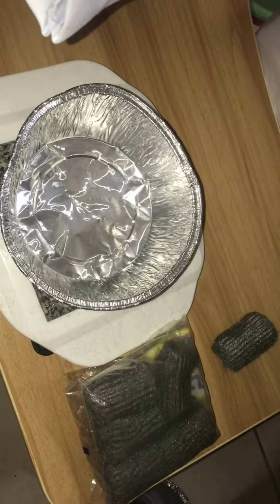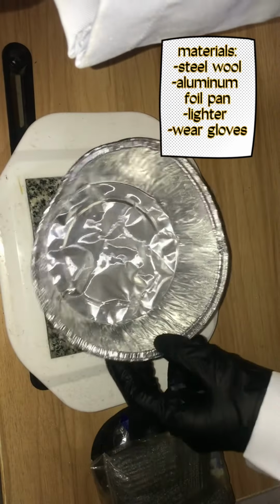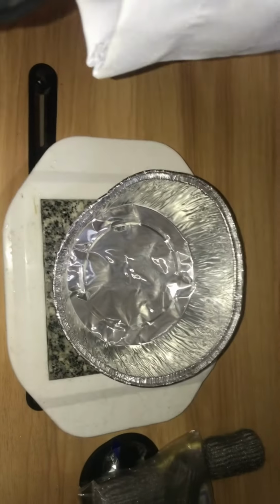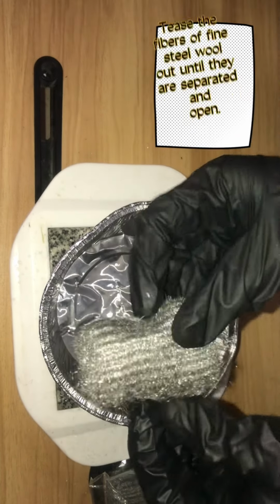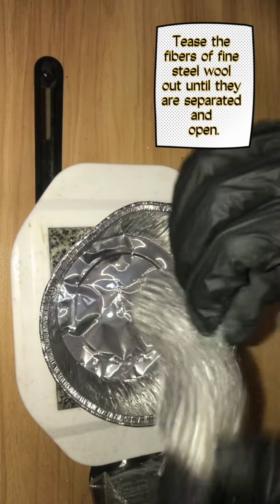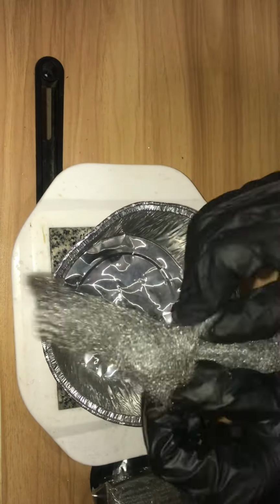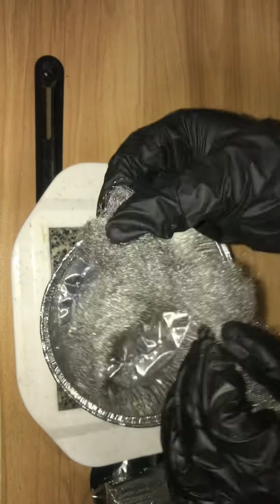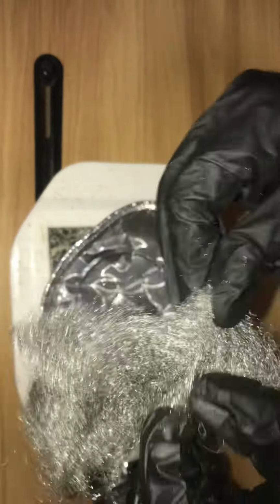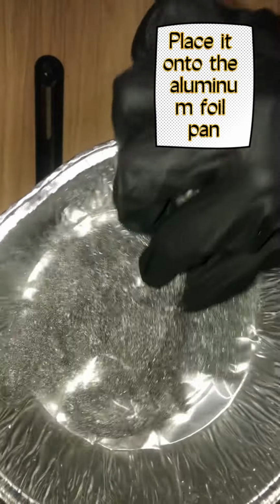The first one is burning steel wool. The materials that we're going to need are steel wool, aluminium foil pan, lighter, and also gloves. First step is to tease the fibers of fine steel wool out until they are separated and open. Then place it onto the aluminium foil pan.